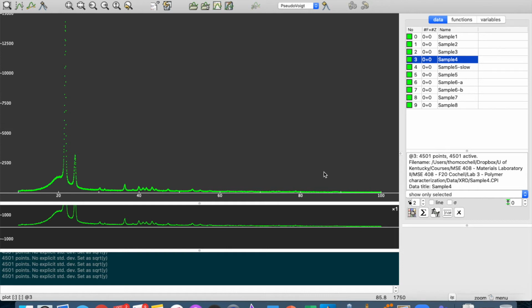So obviously, if there are peaks, we get d-spacings and we get what plane that corresponds to and so forth. But also you get a lot of qualitative information about the crystallinity of these polymers. And again, I'd refer you to the XRD chapter in Ling to help you out with some of this information. All right, so that's what we're going to have to look at.